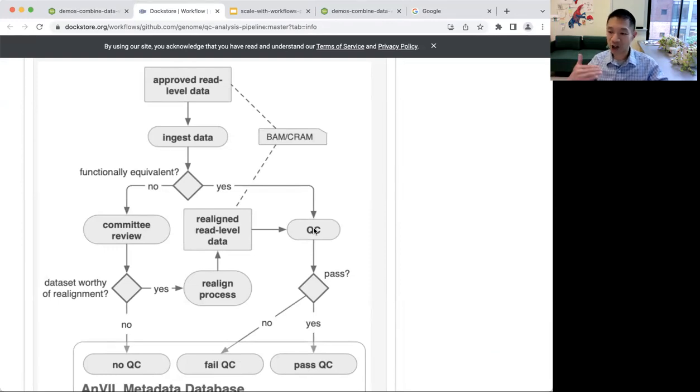And then depending upon the thresholds that you set, is there sufficient quality? Is the contamination low enough? Is the coverage high enough? It reports whether it passes or fails the relevant QC metrics. And different consortia have different thresholds, and you yourself could have different thresholds here. Fundamentally, all of these are being calculated for you, whether it's 1 sample, 10 samples, or 100 samples.